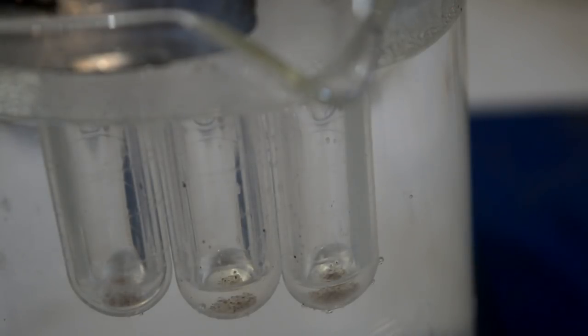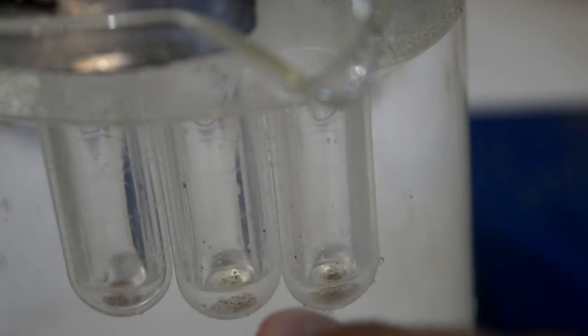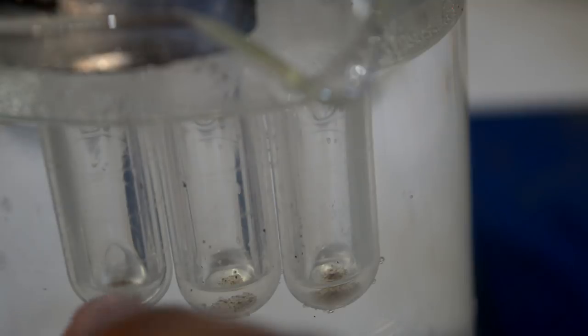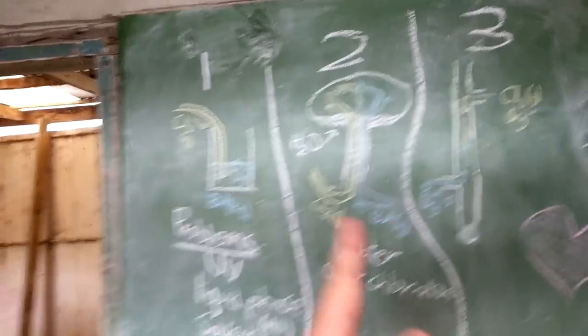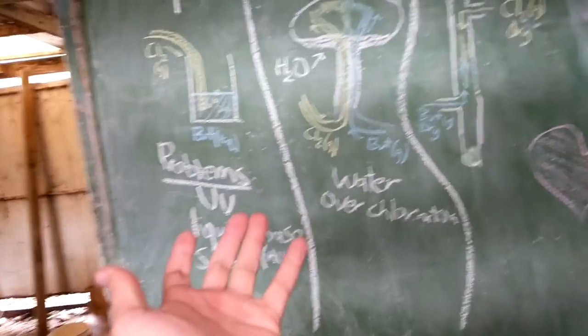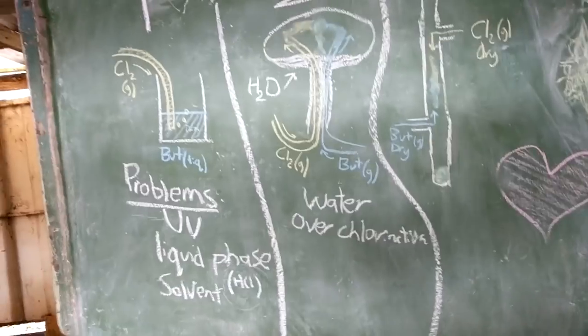So here we have just a final test. I have some methanol, some of the pre-distilled substance and some of the stuff we distilled over and just in some hot water. And then there's a little bit of sand in each of the tubes. And we can see clearly that the methanol is boiling very readily whereas these two aren't doing anything. Because our product should boil at 62 to 64 which is the same as methanol. So it's not a measuring device or anything. It's just nice to compare it to a known standard like that and see that there's absolutely nothing in either of these two. So every single attempt we've done, all three of these have given us the same product which is, I have to say at this point, has to be the overchlorinated product.